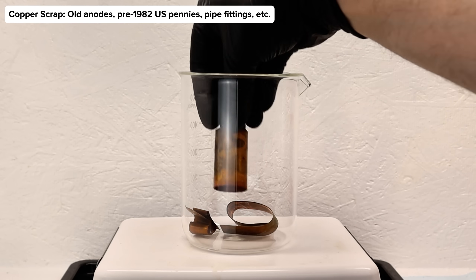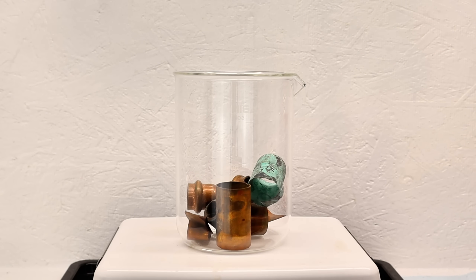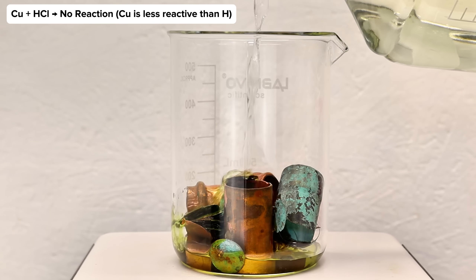To get started, I've got some scrap pieces of copper which I added to a beaker along with some concentrated hydrochloric acid. Copper is a noble metal and not readily attacked by hydrochloric acid alone, and so to get it to dissolve to copper chloride, it needs oxygen.